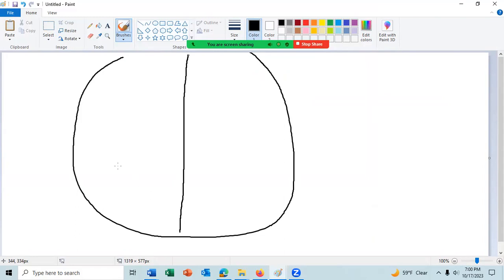And what you can do is just mark on the back of the plate with a marking pen, a felt pen. And then you label this sector 1, sector 2, sector 3. Let's see if I can do that. And sector 4. Kind of.